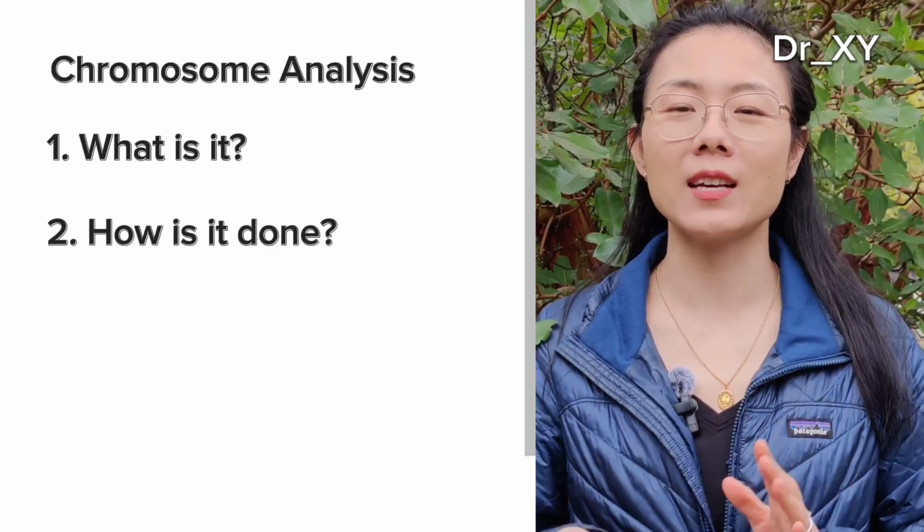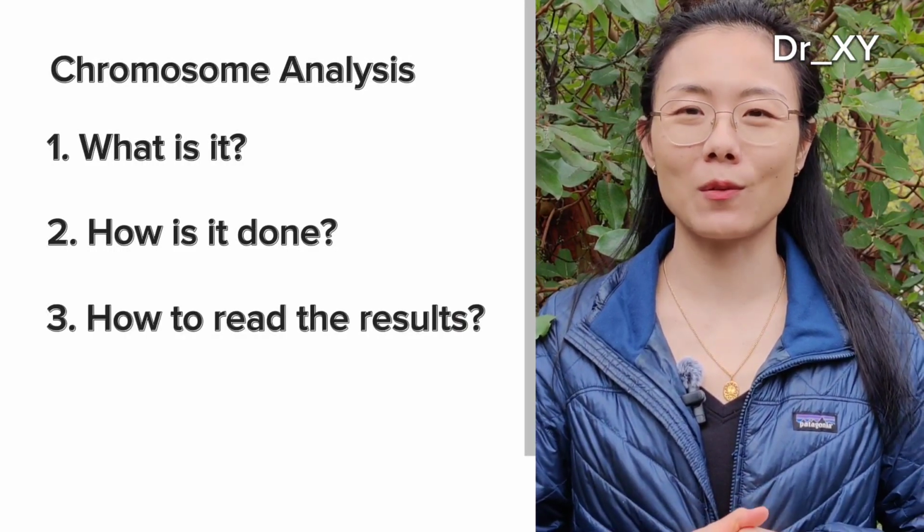Today we'll talk about chromosome analysis, what it is about, how it is done, and how to read the result from a chromosome analysis.